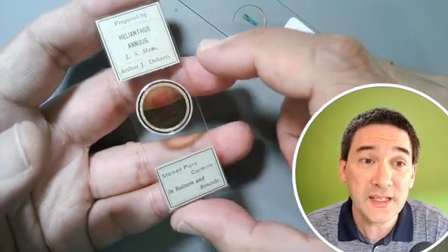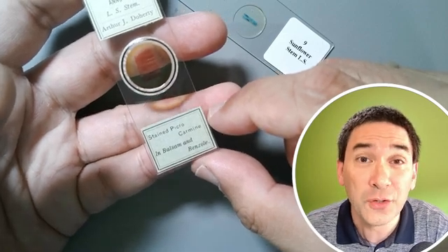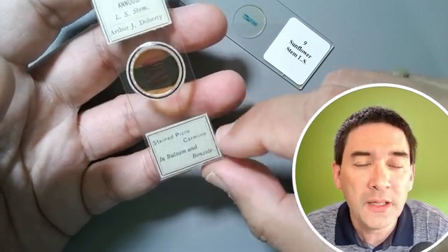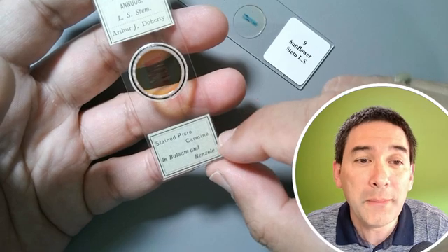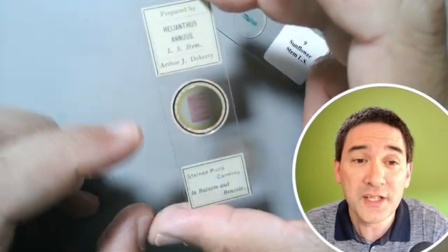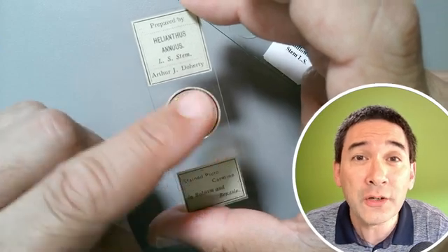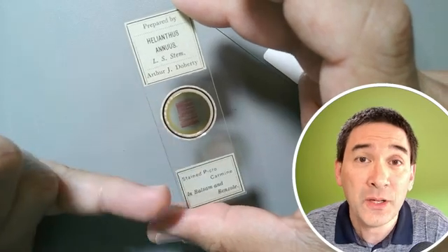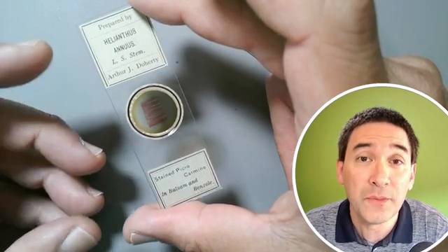This is a really nice slide with a lot of information on it. It tells you how it was mounted and how it was stained — for example, carmine, that is the name of the stain, it stains red and is actually a food coloring. The slide uses the mounting medium called balsam, which refers to Canada balsam, very popular at that time. The slide also has a beautiful ring, which was added to prevent moisture exchange and to increase the longevity of the slide.